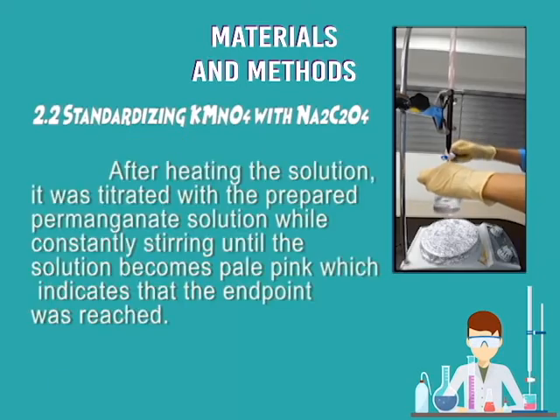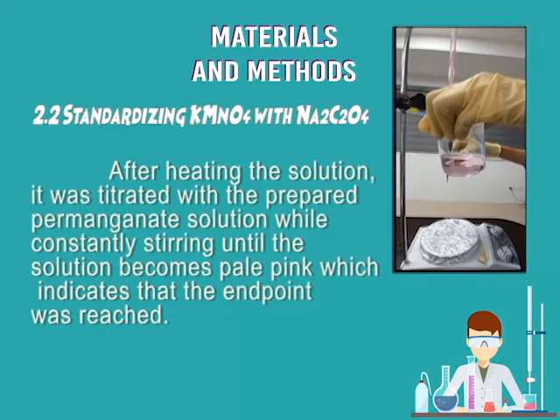After heating the solution, it was titrated with the prepared permanganate solution while constantly stirring until the solution became pale pink, which indicates that the endpoint was reached.